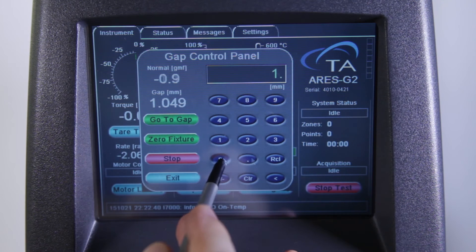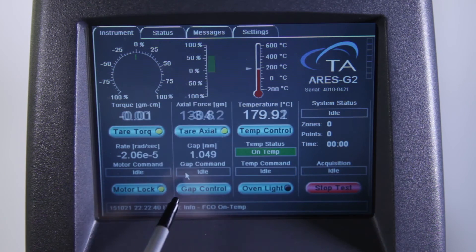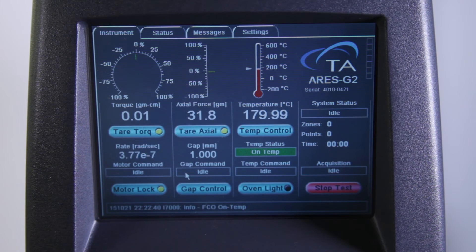Close the furnace and set the trim gap. Monitor the axial force. Once at trim gap, it is important to allow the axial force to relax fully prior to trimming.